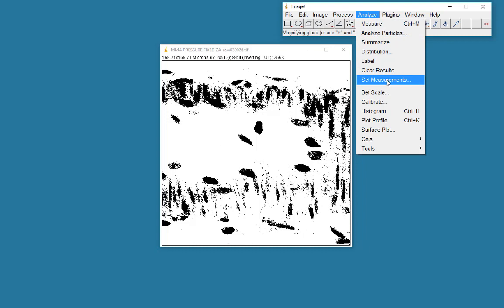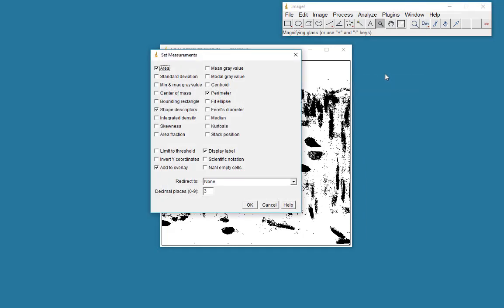And before that, I want to set my measurements. The area and shape description. So I really want to know the shape. This is a morphometric measurement, which measures shapes. So I'm going to get the shape descriptors. And I'm going to analyze particles.